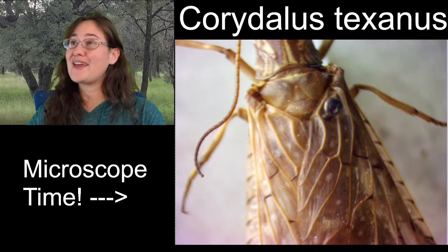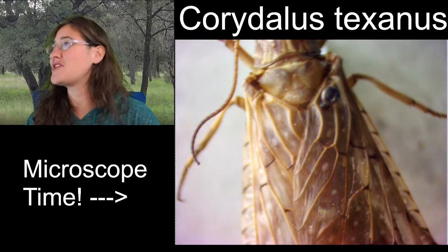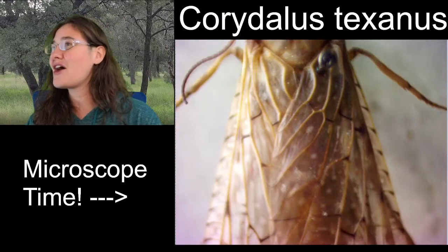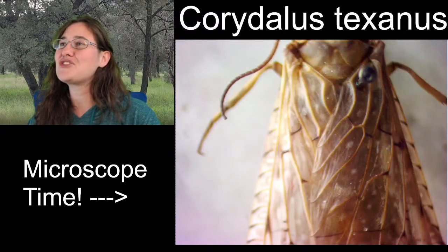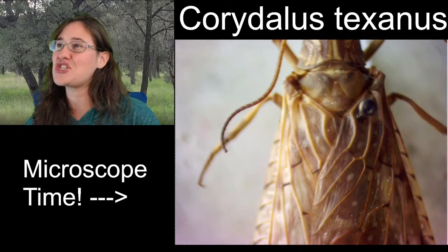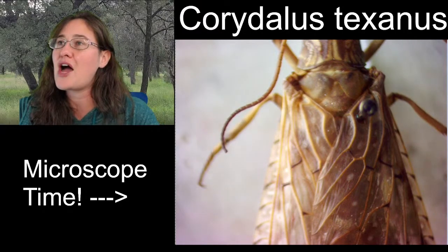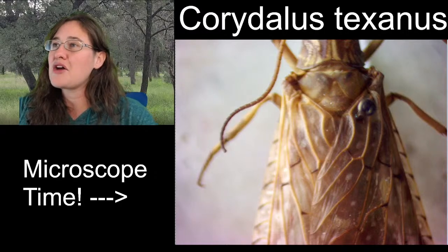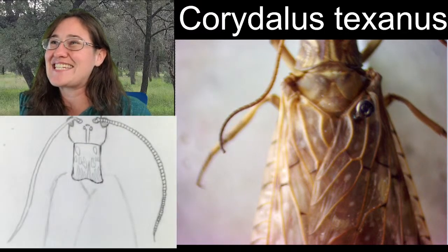Now, the wings are more than half of this specimen, like Susan had mentioned earlier. So, we are going to take just a little bit of time on the wings. I don't want to spend a whole lot of time sketching every wing venation, but I can show you which ones are important and which ones I'm going to choose to sketch.